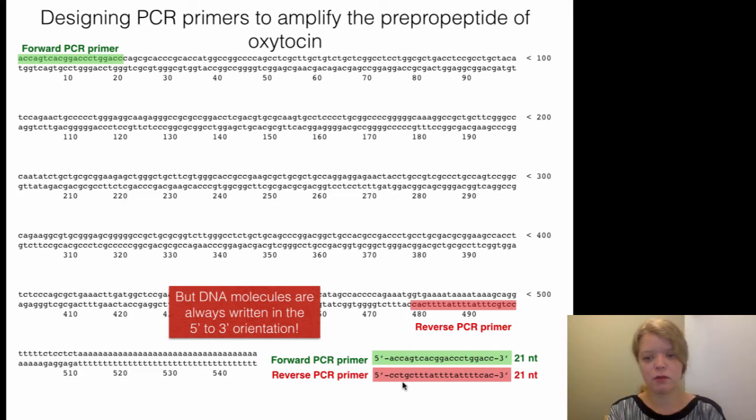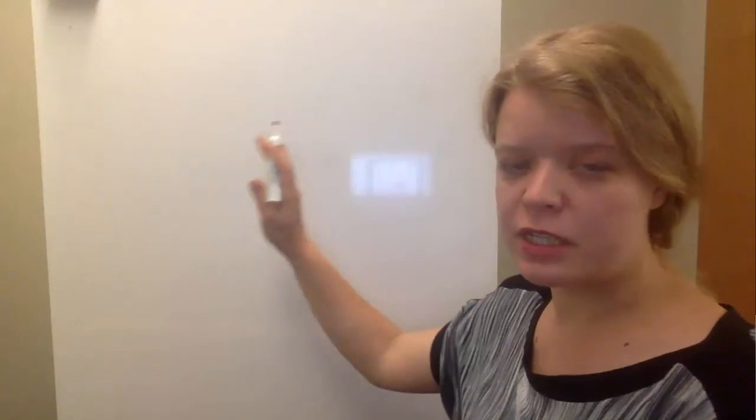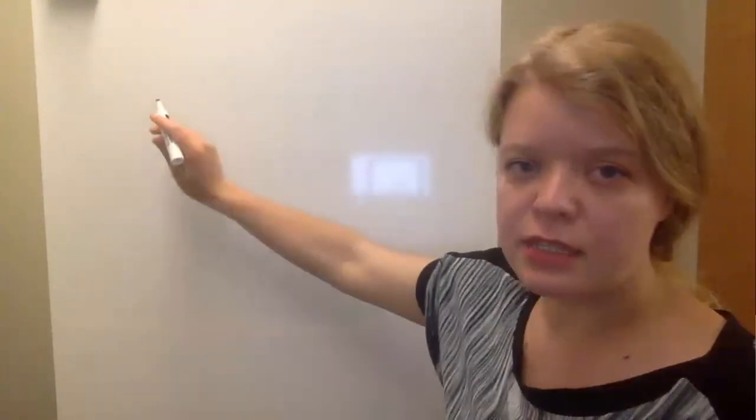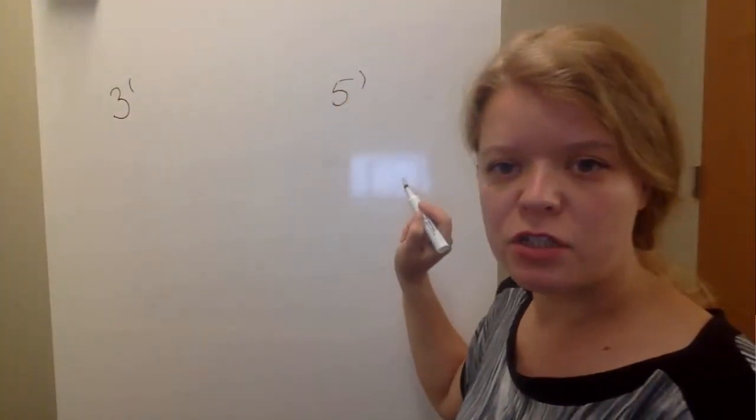So here we go. Now the sequence has been rotated. Mind you, I did not complement anything. I didn't pick the other strand. No nucleotide was changed there. I just reoriented it. So to explain this even more, let's see what I did. Okay, this is how you reverse a primer. First, you copy the primer in the orientation that you happen to have it in. In this case, it's a 3 prime to 5 prime orientation because it's on the antisense strand and DNA is antiparallel.